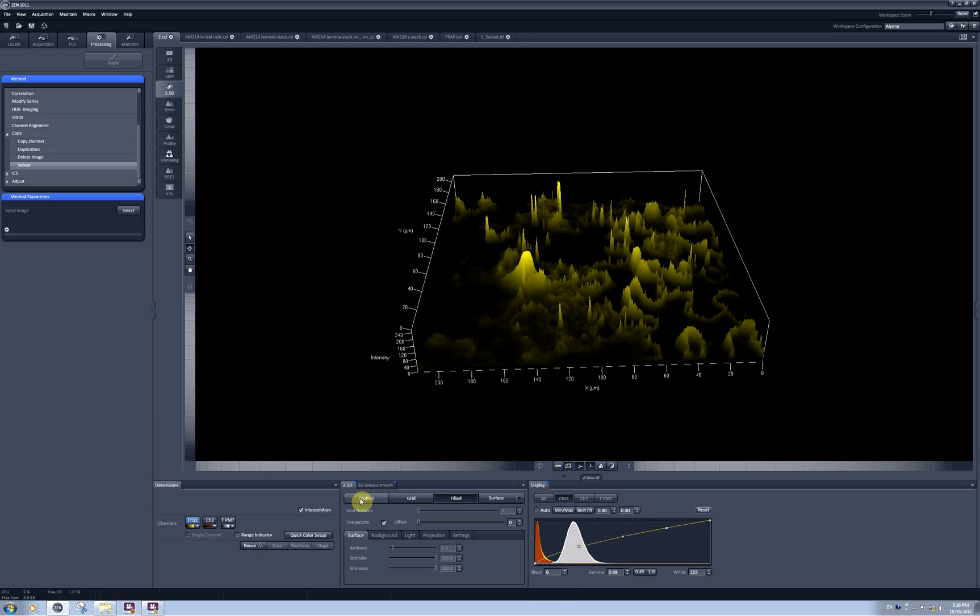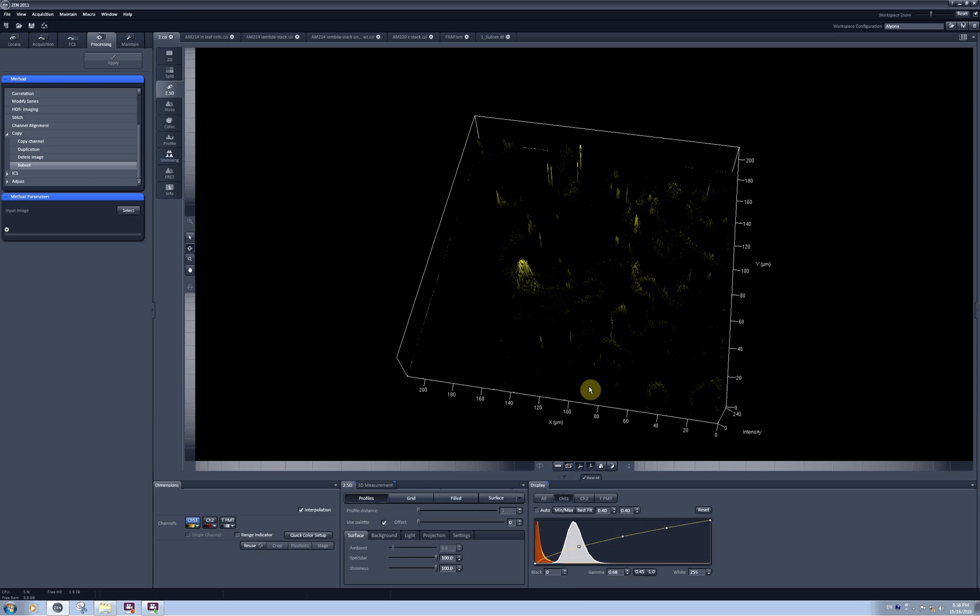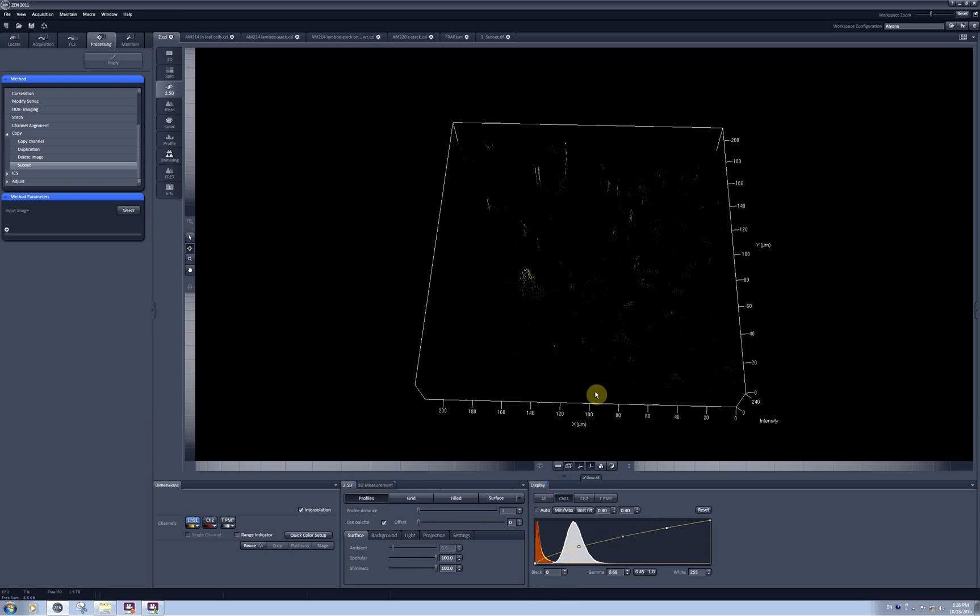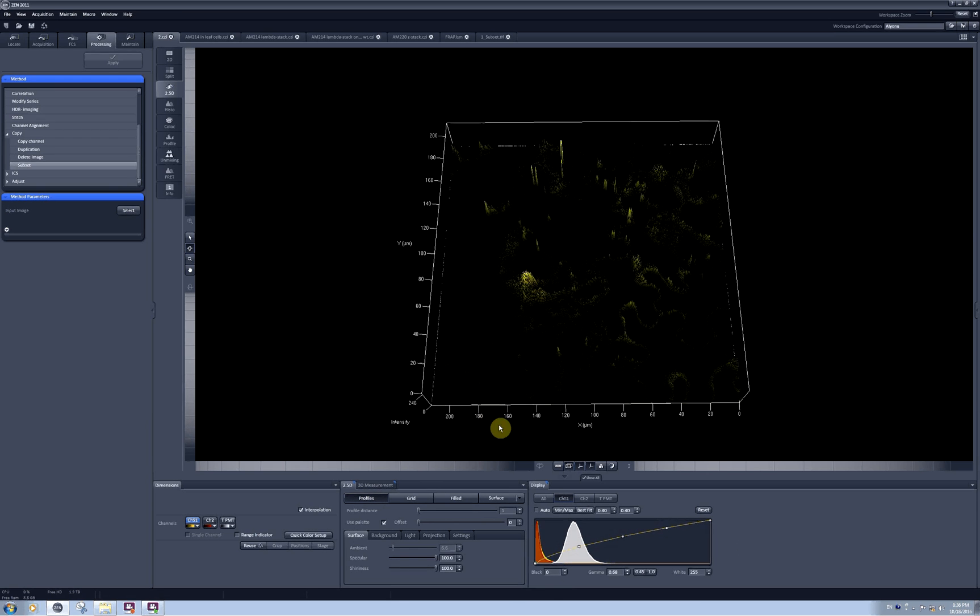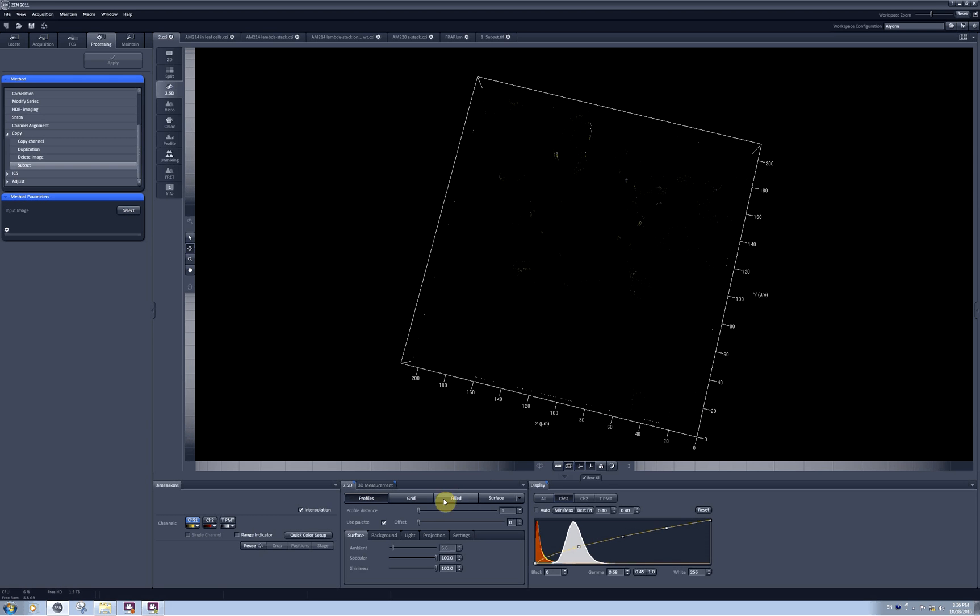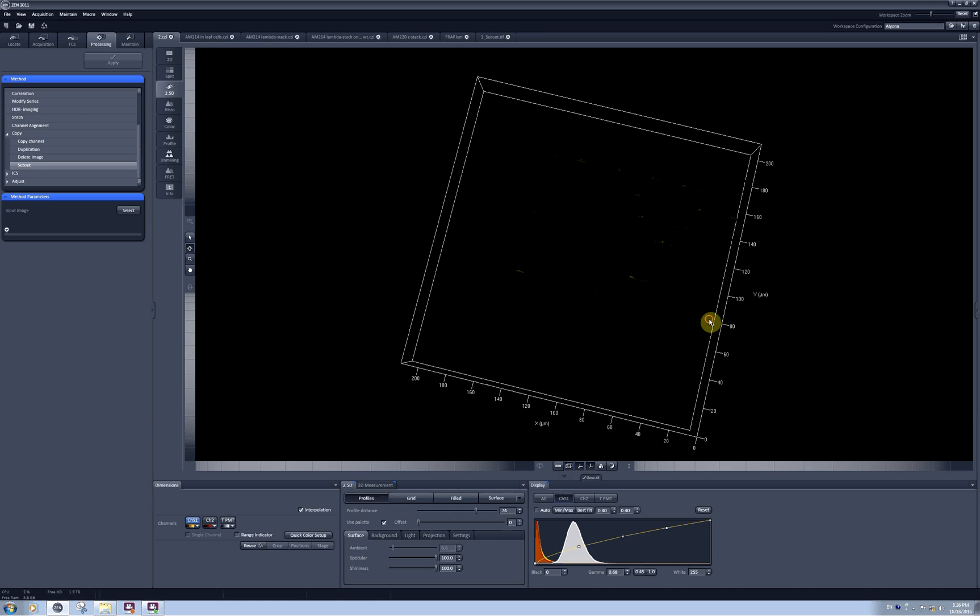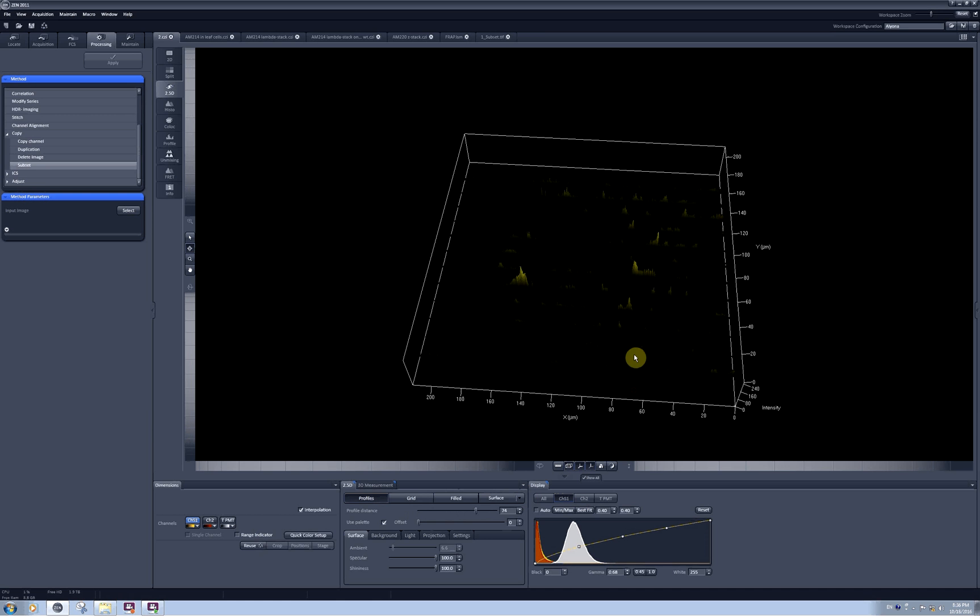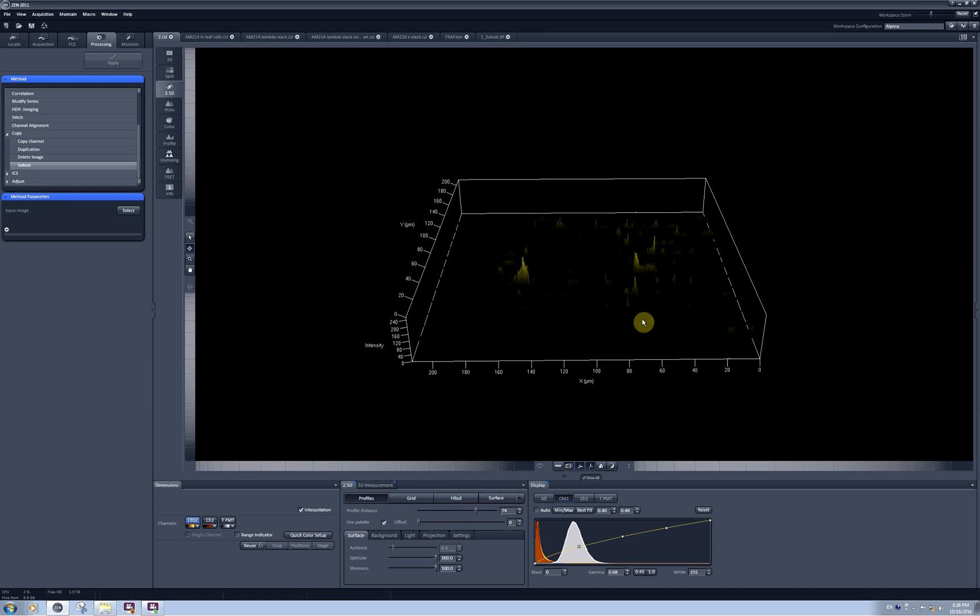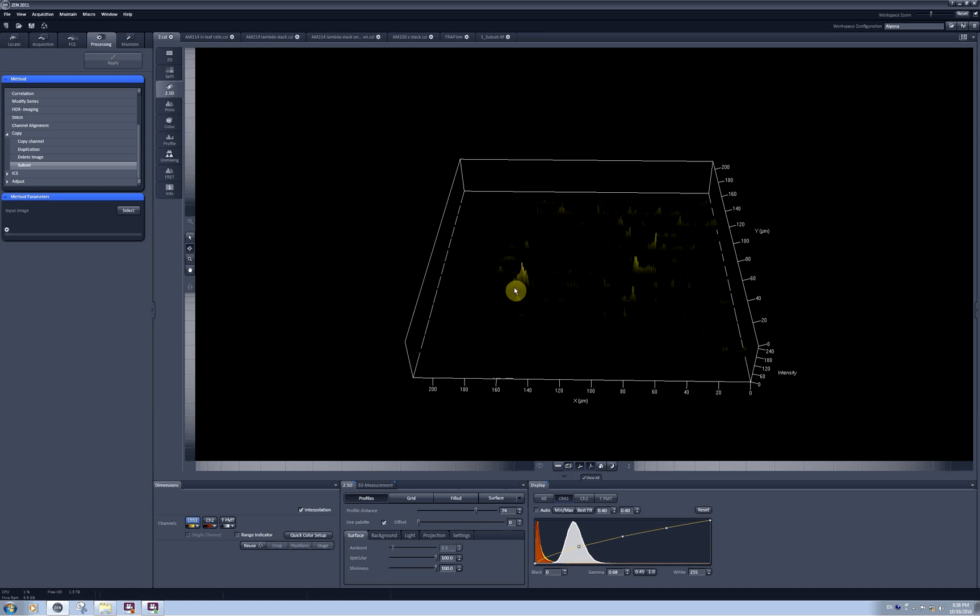There are several different ways how you can plot the intensities. There is profiles, which allows you to build profiles of lines along the x-axis, and you can increase the distance between these profile lines by changing the values here. So now you can see individual lines with the profiles.